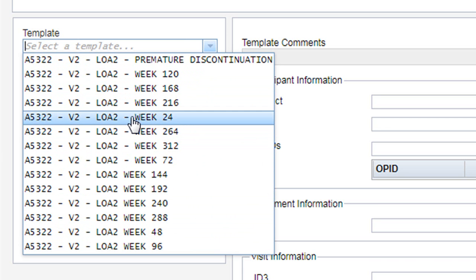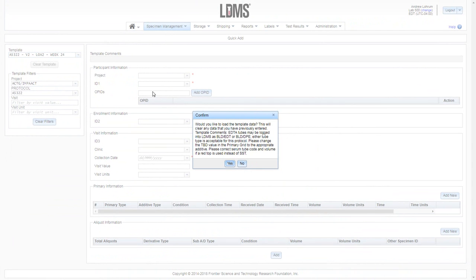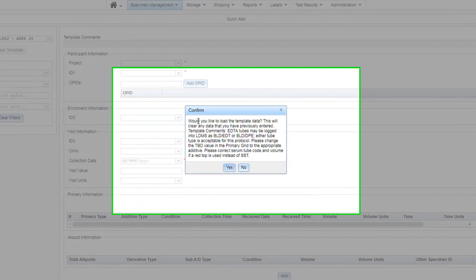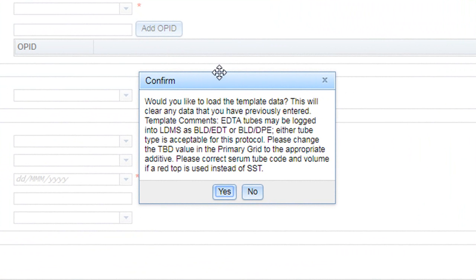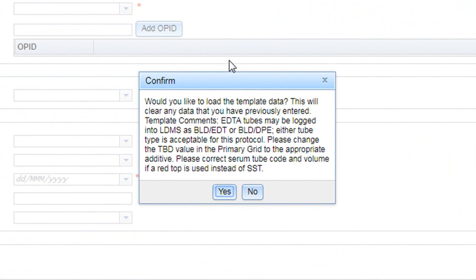Highlight the template that you wish to load. You will then see the confirmation message. It first asks if you would like to load the template data, and warns that this will clear any data that you have previously entered. So below that, we see our template comments. Now, these comments are coming directly from the laboratory technologist and pertain to this draw. You want to review them and be familiar with those instructions.